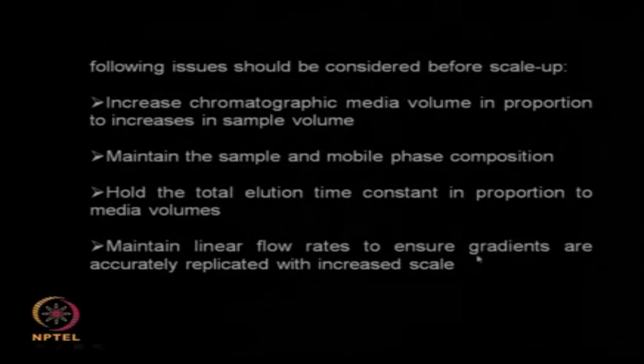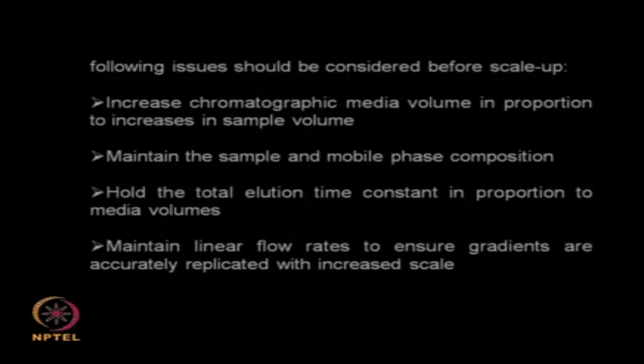I want to maintain linear flow rates so that gradients are accurately replicated with the increased scale. So when I am doing a gradient or a mixture of solvent flow rates in small scale, I want to replicate the same thing in the large scale, so that there is no discrepancy when I scale it up from small to large scale.